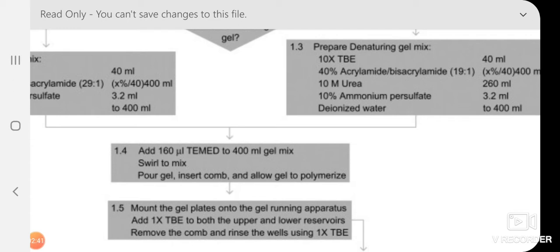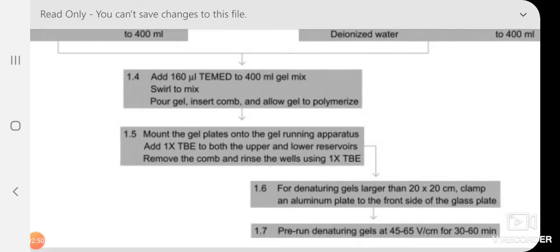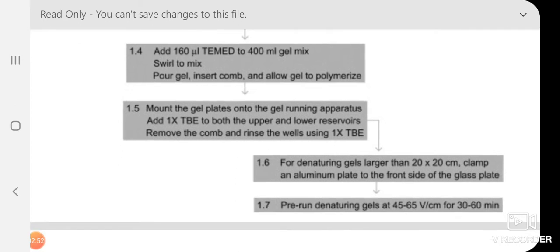Mount the gel plate on the gel running apparatus. We use 1× TBE buffer for running. For the denaturing gel, we need an aluminum support plate in front of the glass plate, and we do a pre-run before loading the sample directly, in order to warm the gel.